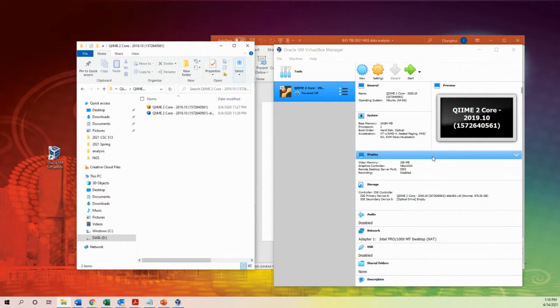Professor, I clicked it and it says import. Should I click import? Yes. If you're done, you can raise your hand so that I know, okay? Once you import, try to raise your hand so that I know.